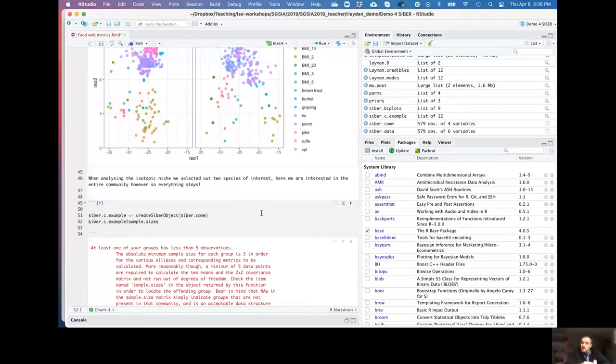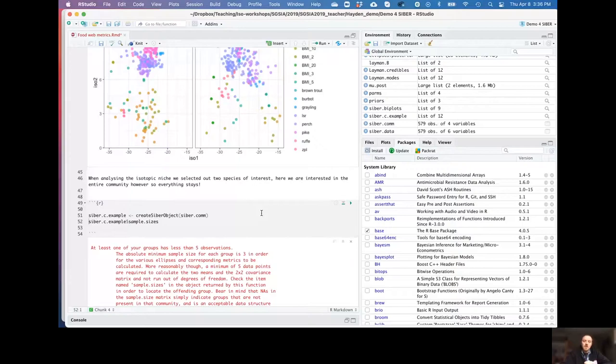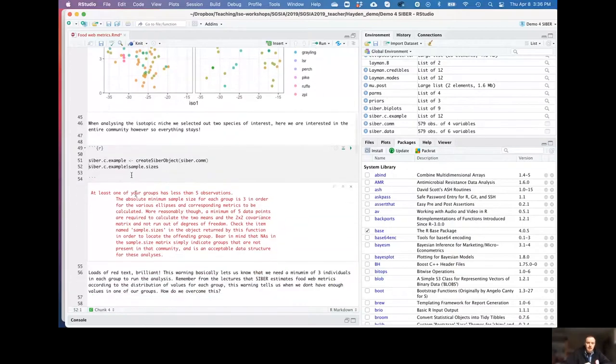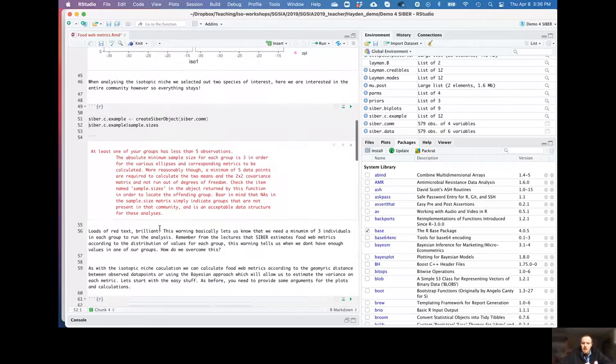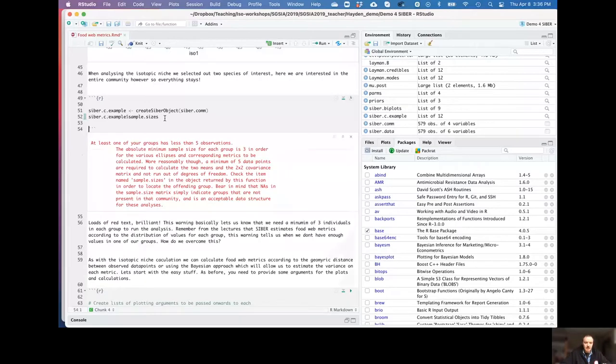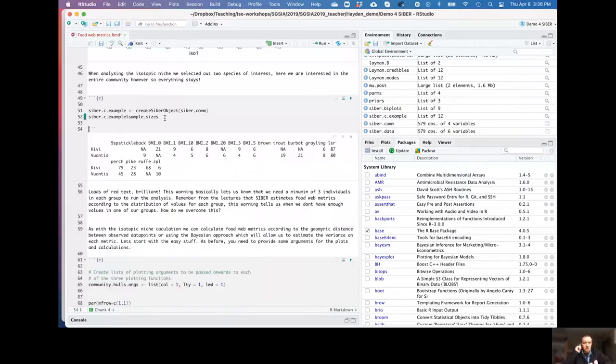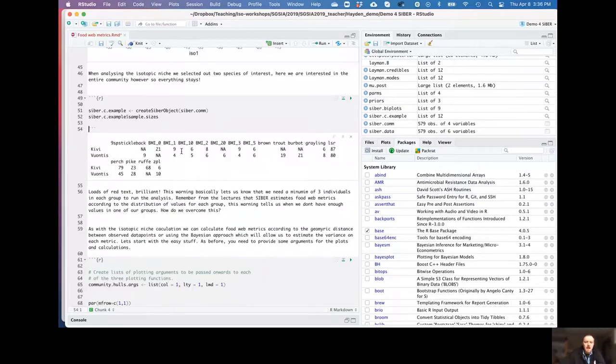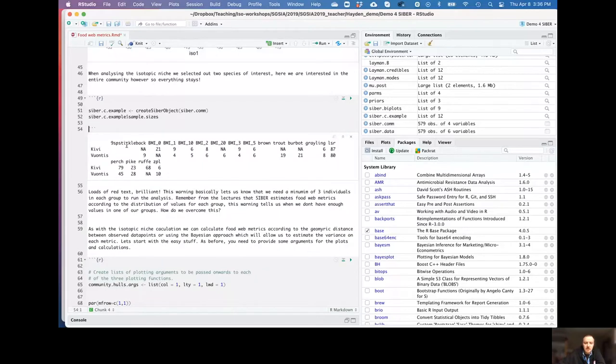So we can only do this where we have three data points for each of those nodes. And that's another reason that we've done this based on putting the invertebrates by depth, because we don't have more than three of each taxa at each depth. So this is something to bear in mind if you're at the start of a project and thinking of your sampling strategy. If you want to do these food web metrics and go into a great amount of detail, you're going to have to make sure that you have enough samples at each site.